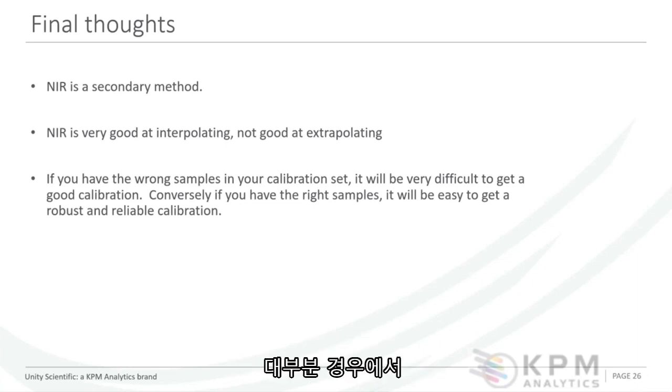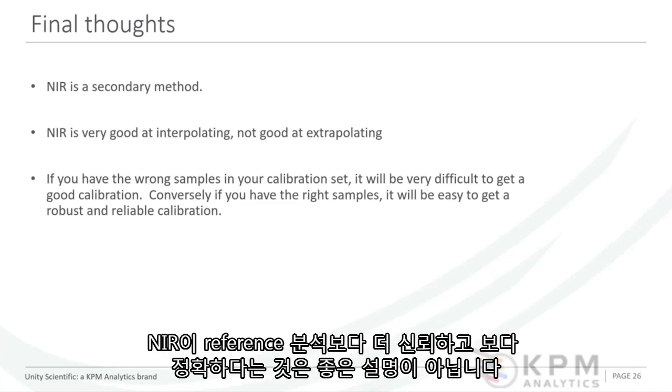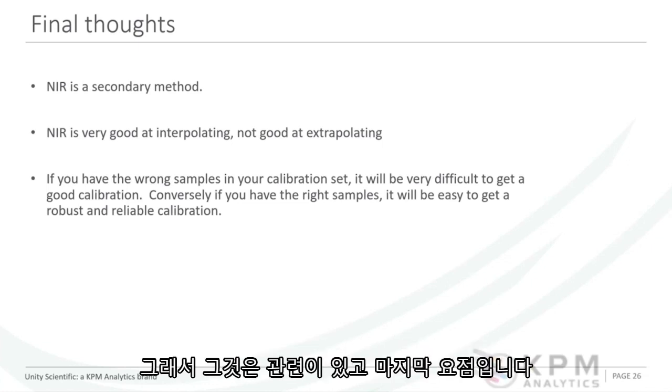In fact, in most cases, I'm going to trust the NIR more than the reference method that it's based on. Near infrared is in general very precise and very repeatable, but it's not very good at extrapolating.